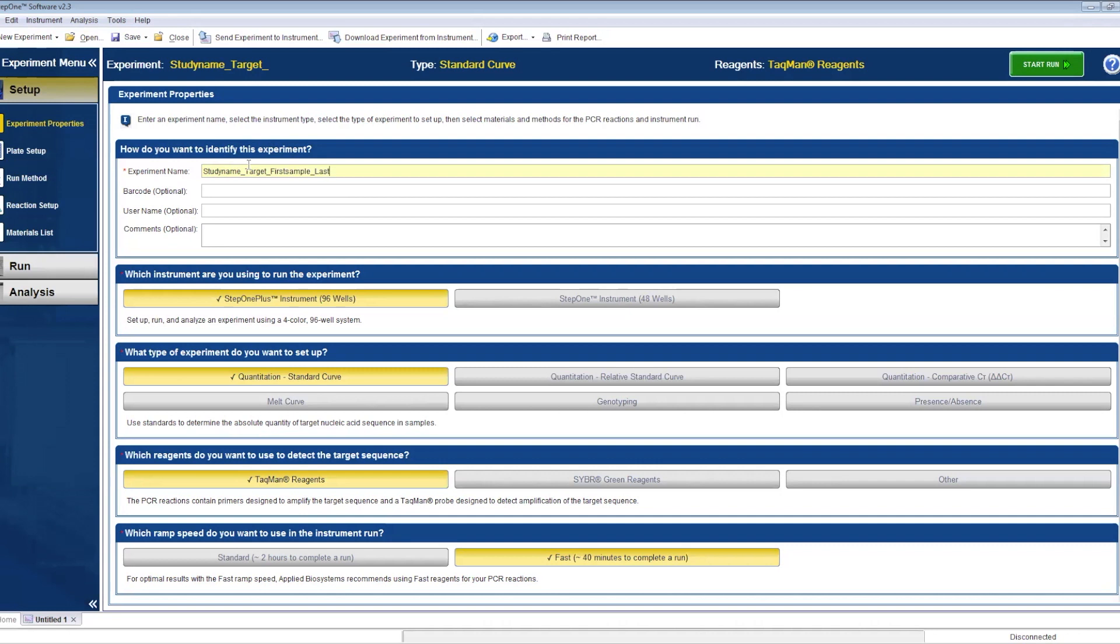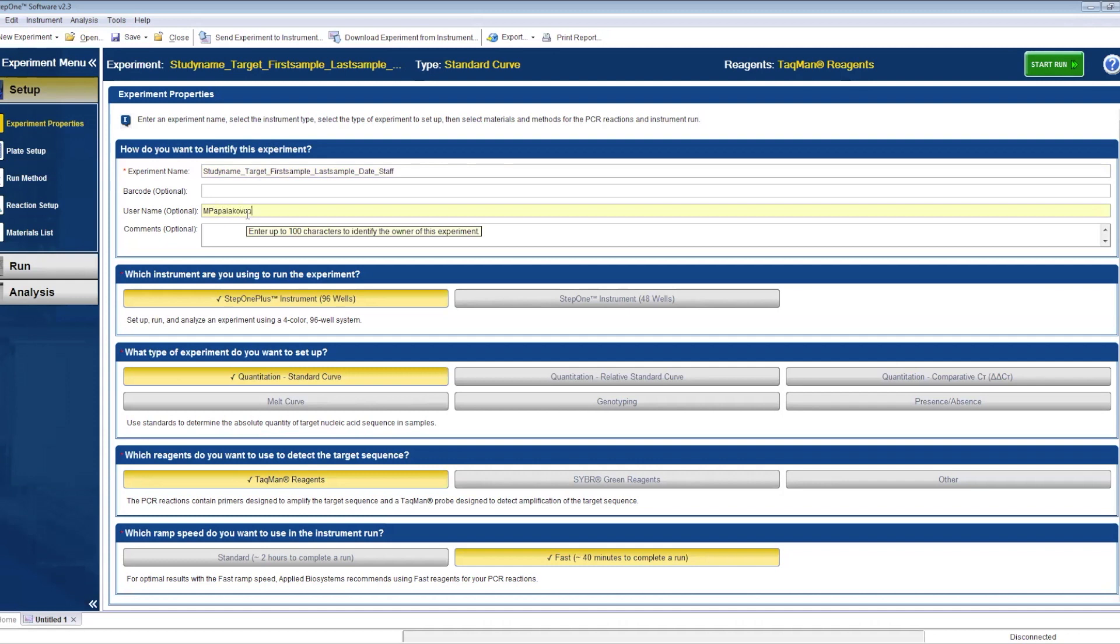Make sure you pick the right instrument with the right platform, 96-wells in our case, and choose quantitation standard curve. The reagents we have been using are the TaqMan ones - we'll share the published references at the end - and we run the cycle for nearly two hours, the standard run.